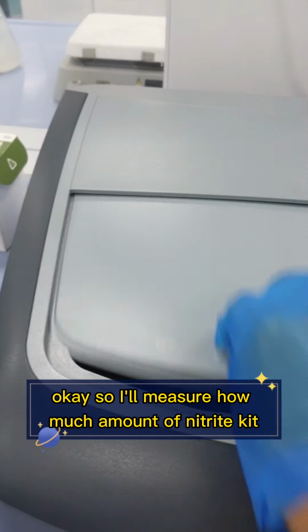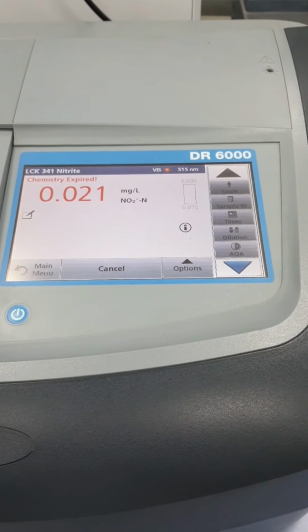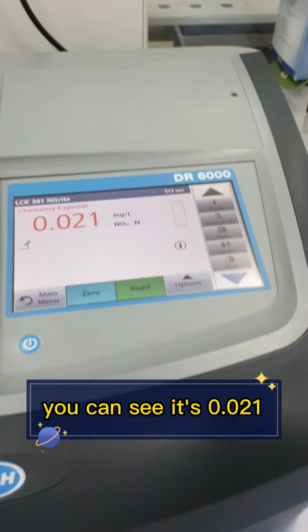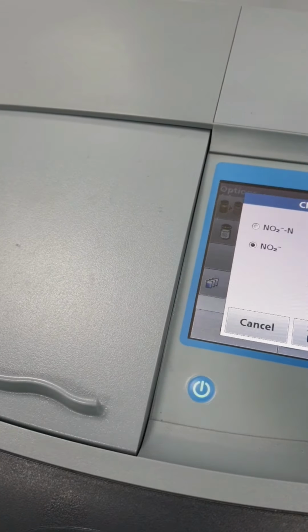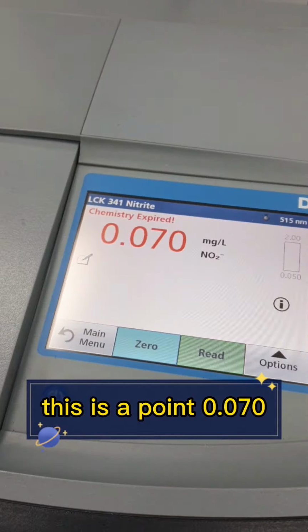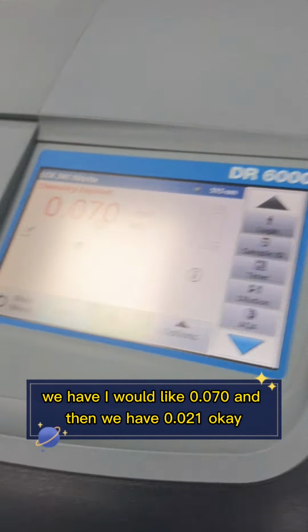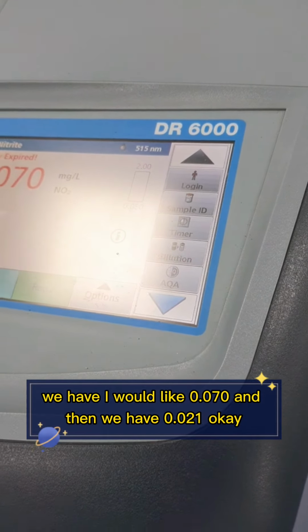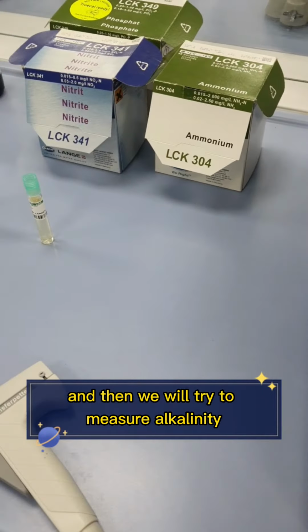Okay, as now I added nitrite kits, I'll measure how much amount of nitrite is in the water. You can see it's 0.021, and then we will change the form, and then we'll press. So you can see here this is 0.070. So nitrite we have 0.070, and then we have 0.021. And then we will try to measure alkalinity.